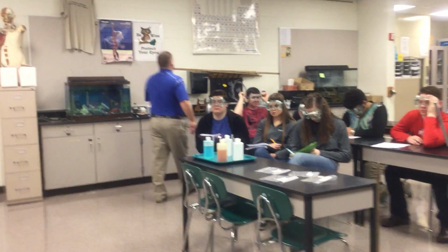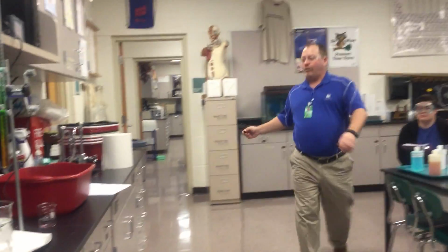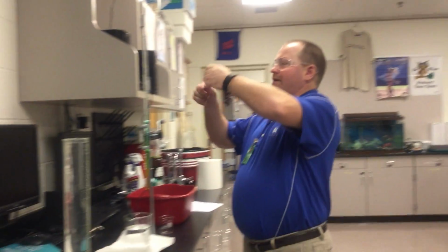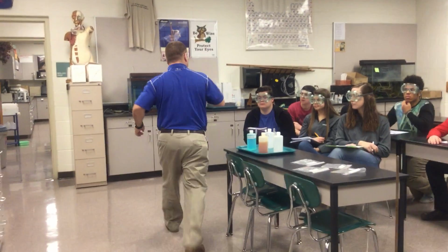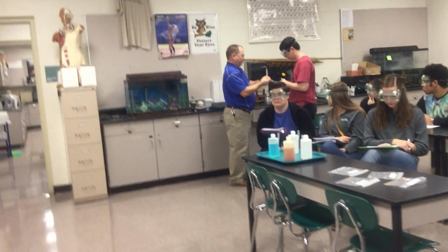So I have a one-hole stopper right here that I'm going to put in, but I need to get my magnesium strip, and I need to put it about 5 centimeters. I'm going to need to cut the string, so grab those scissors.